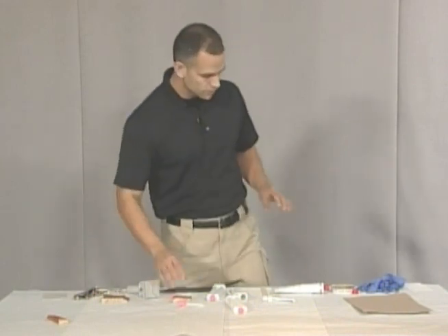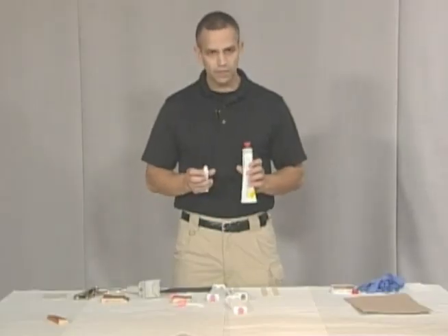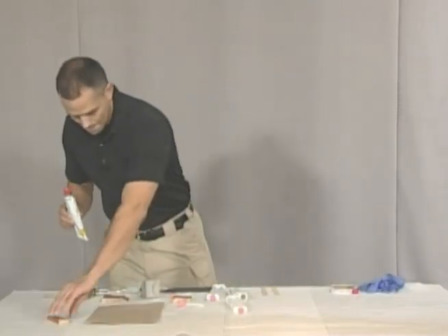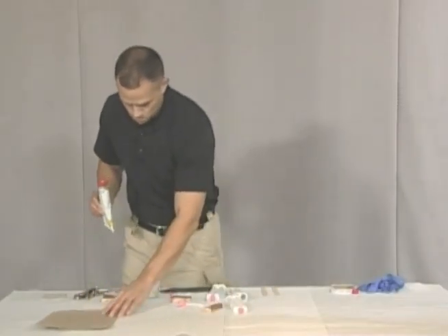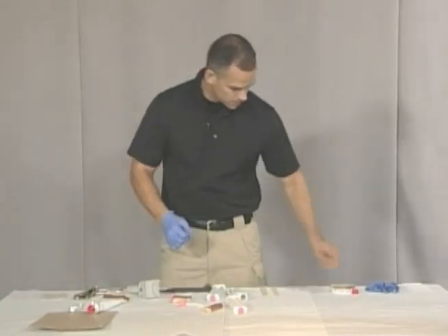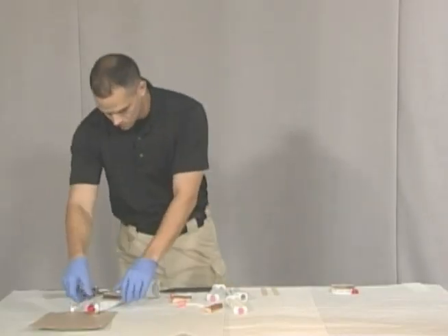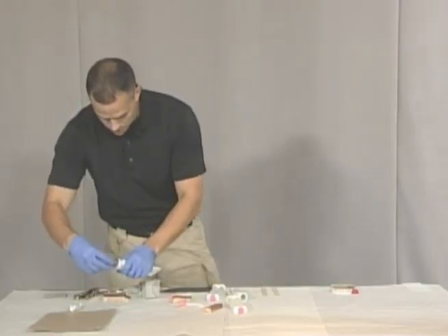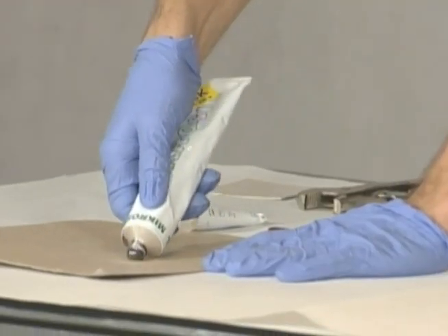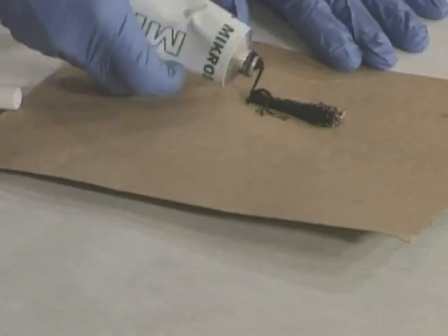The first thing we're going to do is use our Microsil. Microsil comes in two separate tubes — one is the hardener and one is the actual Microsil. I'm going to put my gloves on and then we're going to mix the Microsil. Microsil comes in different colors and this one is black, so first we're going to make a black line.